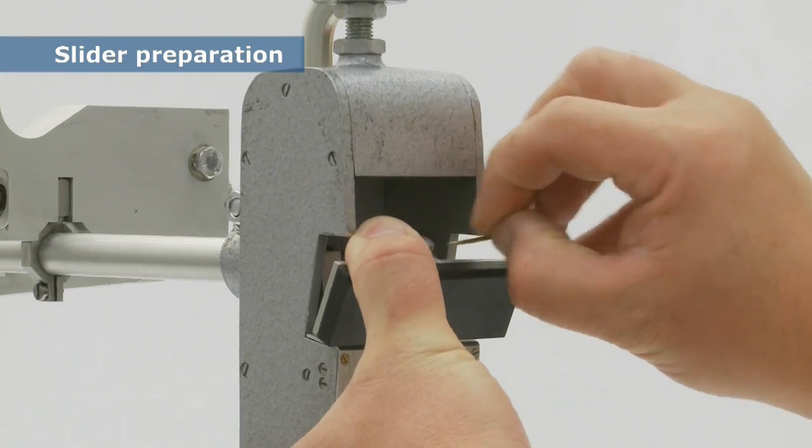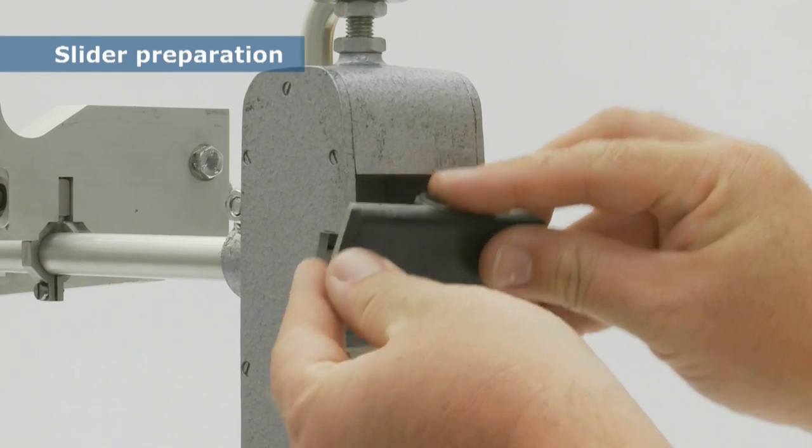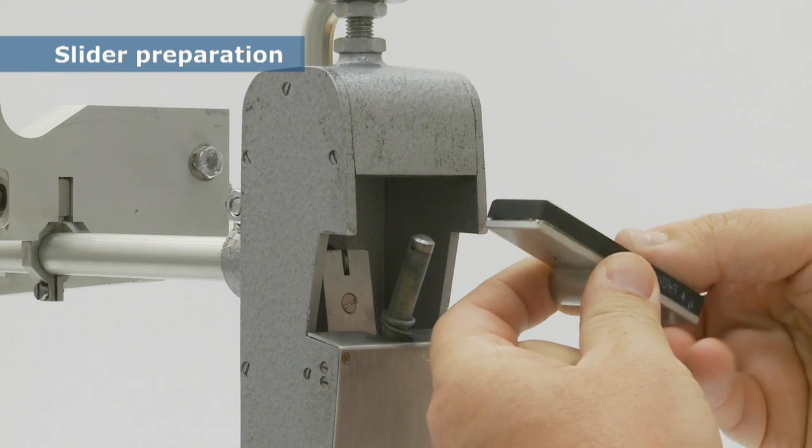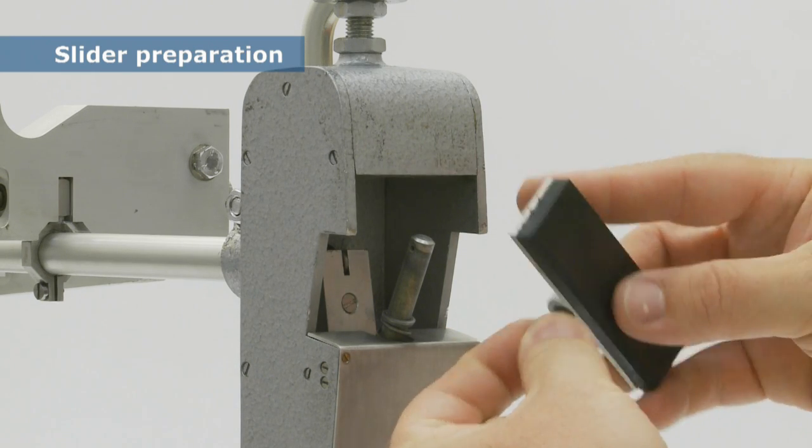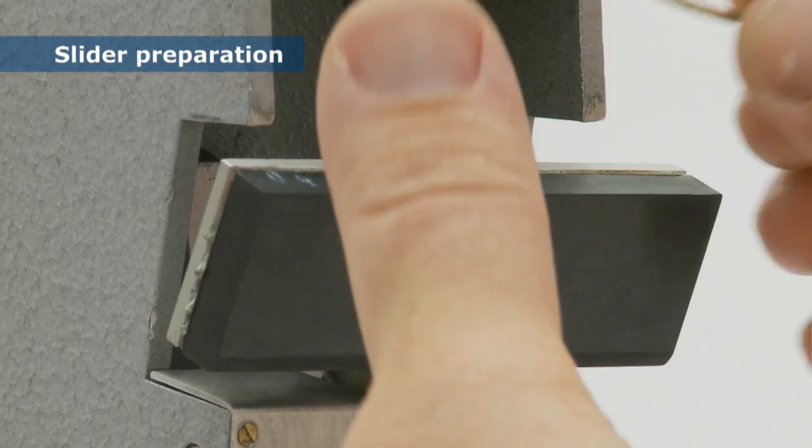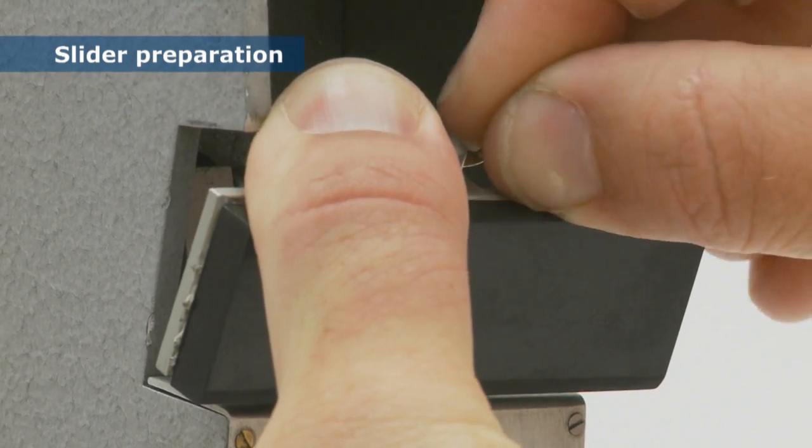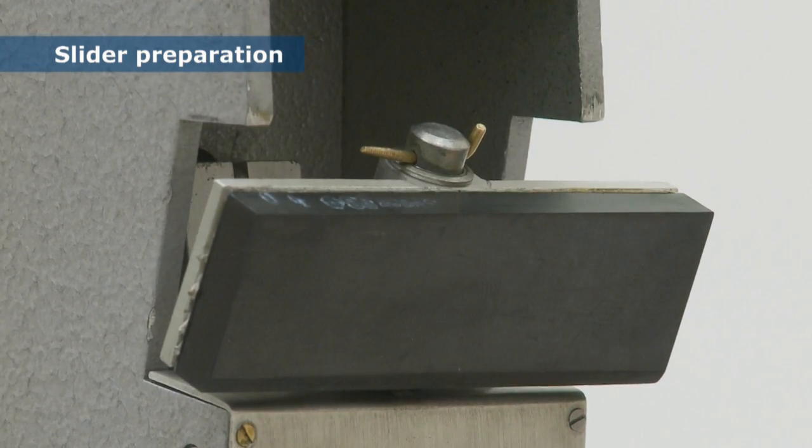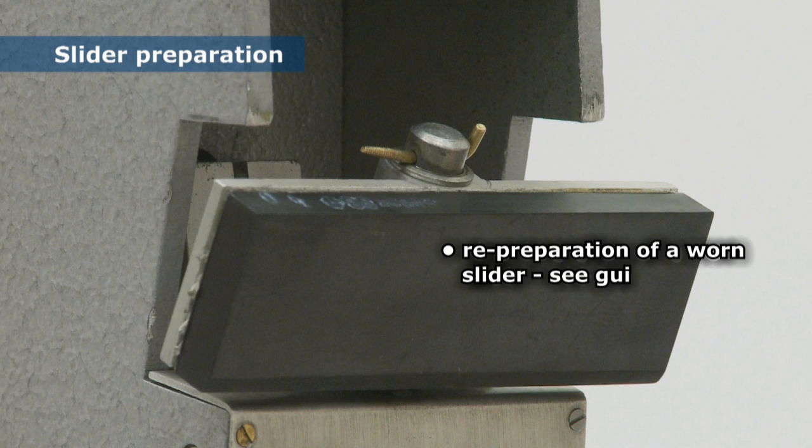The slider 96 used here has been turned over to present a new edge which now needs to be prepared. Note that the spring is compressed without putting any force on the arm while the washer and retaining pin are replaced. The re-preparation of a worn slider 96 is described in the guidelines in section 4.1.